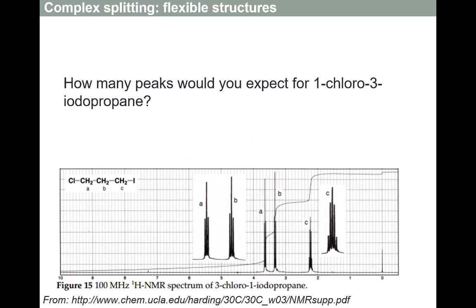All right, so we've got our spectrum listed out like this. I do believe that this is labeled backwards. We would have A and C, it should be. I apologize for that. I lifted this picture. A and C would be our triplets for the left here. So this should be C. And then we have our mess of stuff over here. That's going to be our central ones.